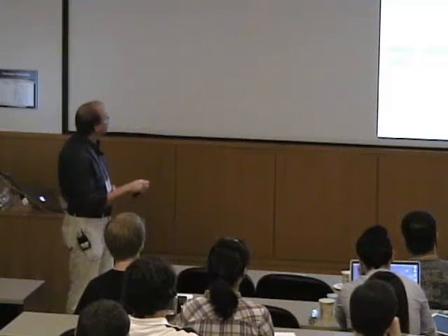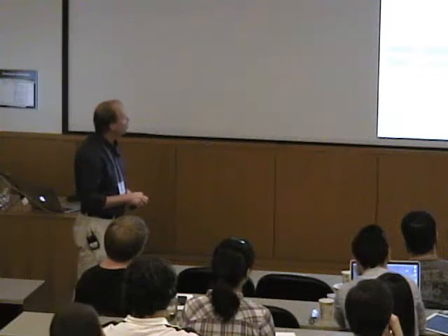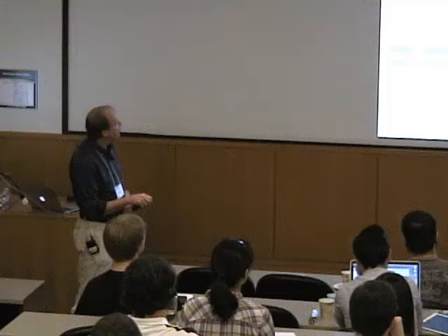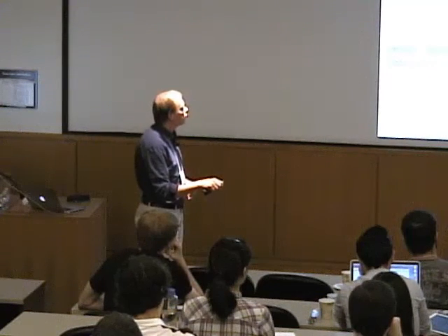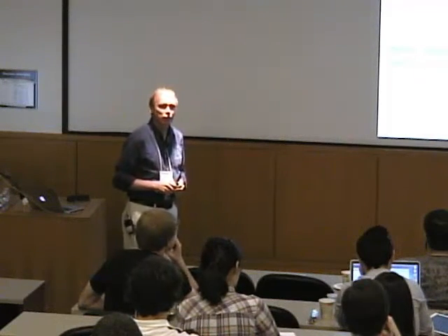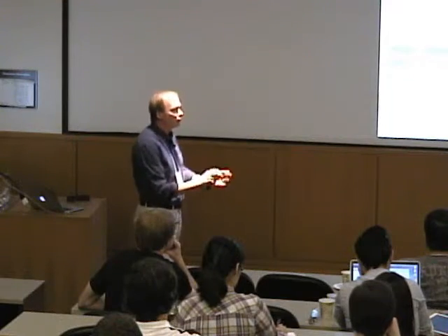In the back of the resonator where the waveguide interfaces with it, there's an opening, right? There's a small hole here, an entrance slit, and then above it there's a screw which can be moved up and down, which has a little metal plate on the bottom of it, right? What we can do with this is change the shape of the opening, and that has an effect on what the standing wave inside the resonator looks like. And so a big part of EPR, the first step, is to adjust this shape so that we have the microwaves coupled properly to the resonator.